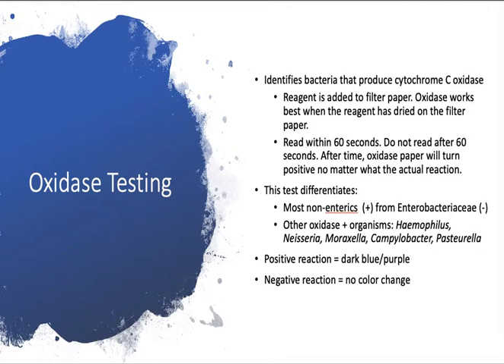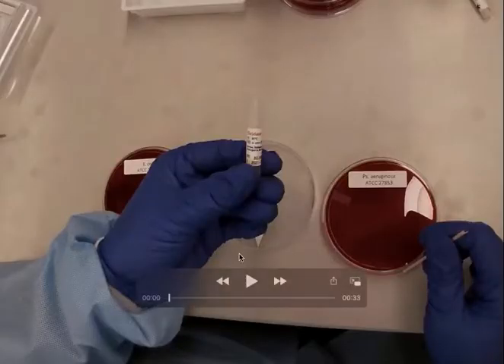Other oxidase-positive organisms include Haemophilus, Neisseria, Moraxella, Campylobacter, and Pasteurella. A positive reaction will give you a dark blue-purple color change on the filter paper. A negative reaction will produce no color change — you might see a little color from the pigment of the colonies, but you should not get a true color change for oxidase-negative organisms.